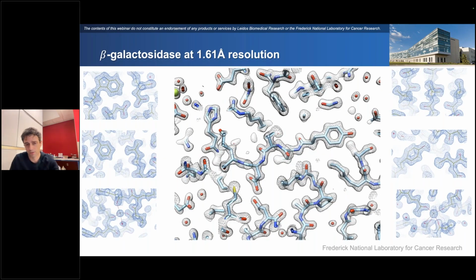So going back to some of the questions that people in the field had asked us about the microscope and the performance, again, 1.8 was an exciting result, especially since we got it early on. But then the question was, okay, is 1.8 angstroms the limit for this microscope at 200 kV? And I'm happy to say that it for sure is not the limit.